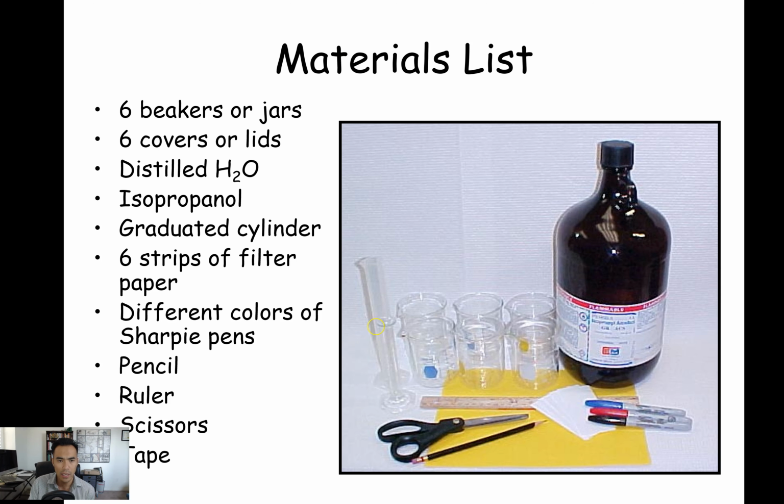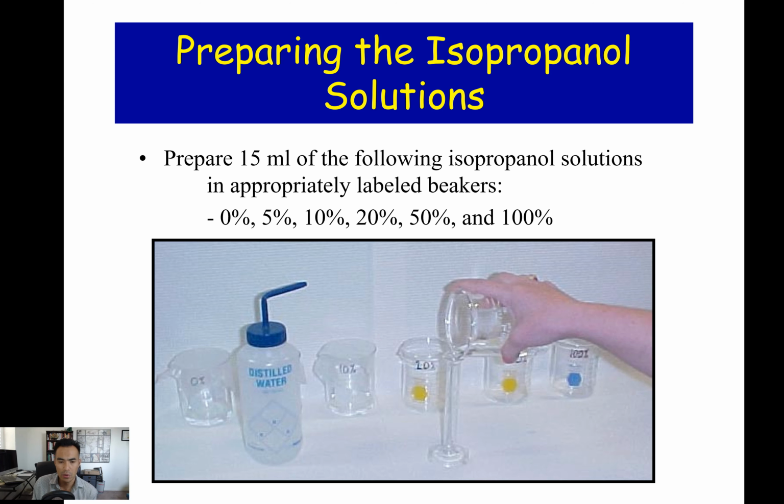And if you take a look at examples, we did not do various different percentages, but we did run for sodium chloride, we did run several percentages regarding how much sodium chloride you have in there. So you should have seen a pattern. Did having higher concentrations of sodium chloride affect the movement? And the question is, why did it do that?